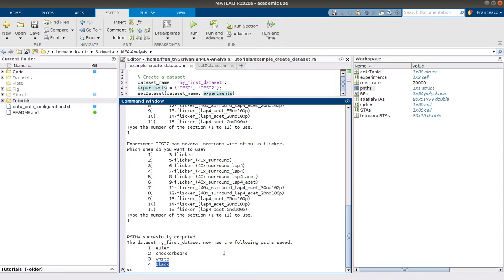That's because in the flicker stimulus I have 2 different types of repetitions, the white flashes and the black flashes. You can know something more about that if you check the tutorials about how to add new stimuli and how to write the repetitions of a new stimuli.